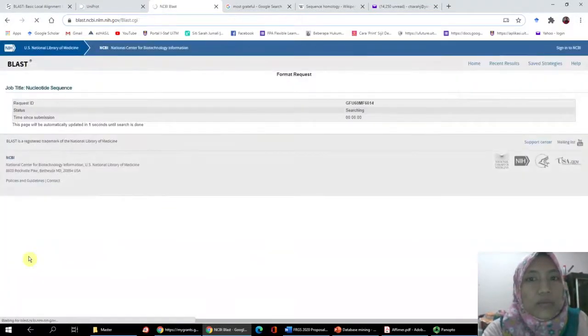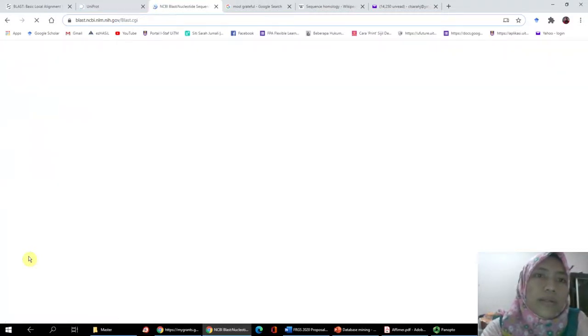After you press it, it's going to take a while because it's searching the database and trying to match everything up to see which one it matches. So I'm going to wait for a while and let you digest the information.